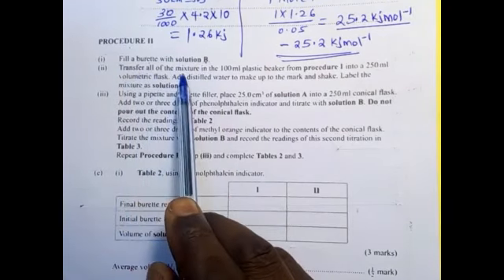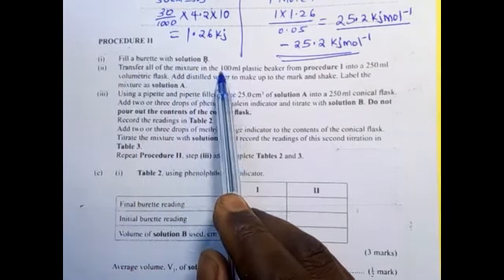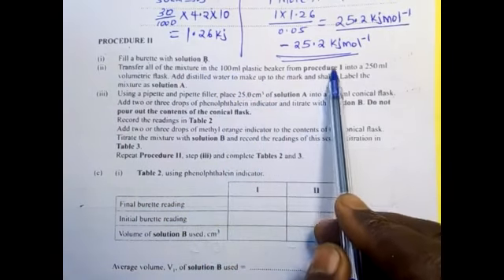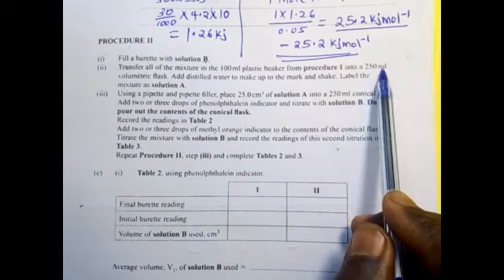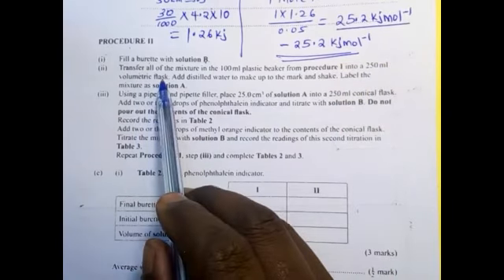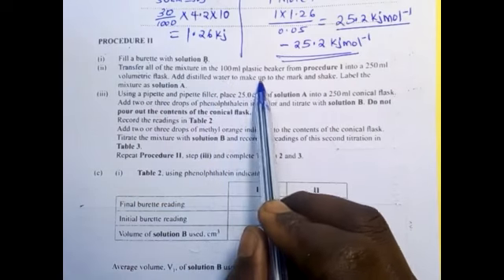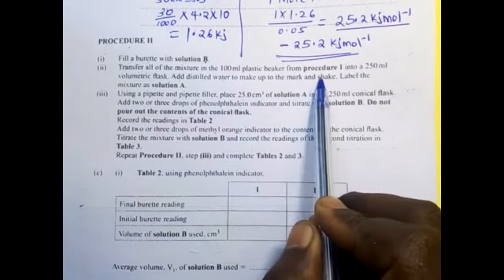Transfer all this mixture in the 100 plastic beaker from procedure 1 into a 250 ml volumetric flask. Add distilled water to make up to the mark and shake.